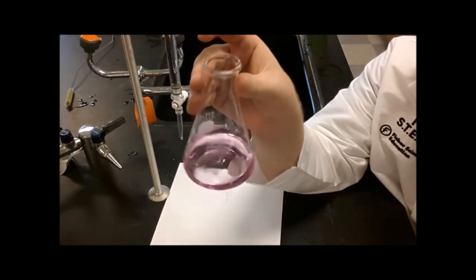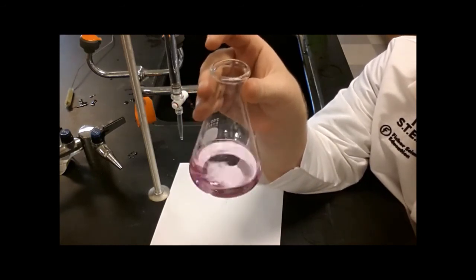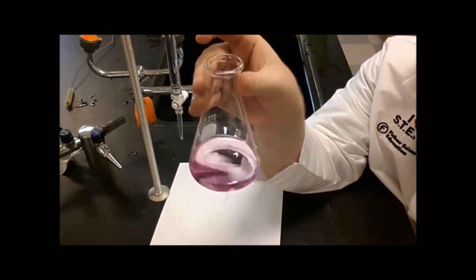Now, for best results, do a titration 3 times or more, and then average your results together.